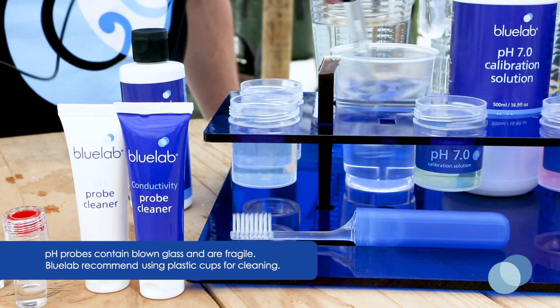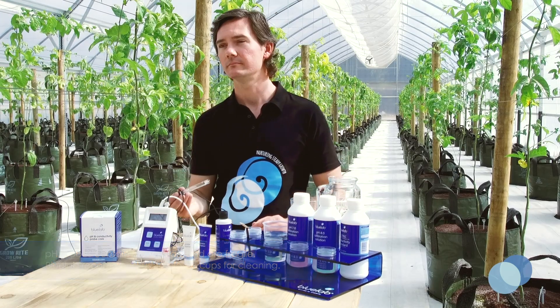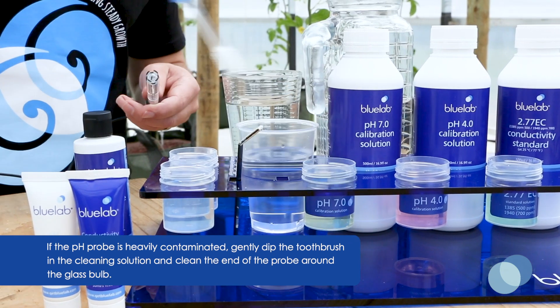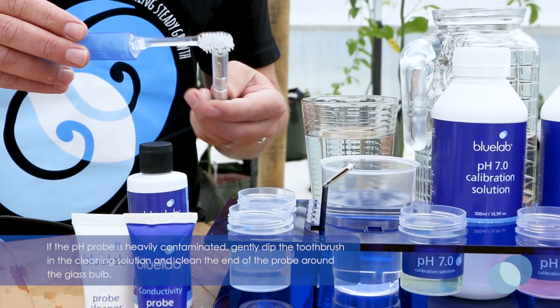Then rinse it in fresh, clean tap water, and make sure all traces of cleaning solution are removed. If the probe is heavily contaminated, dip the soft bristled toothbrush in the cleaning solution and gently clean around the end of the probe on the glass tip.